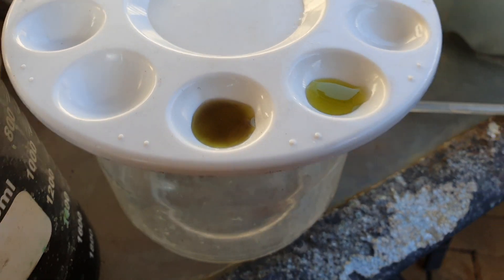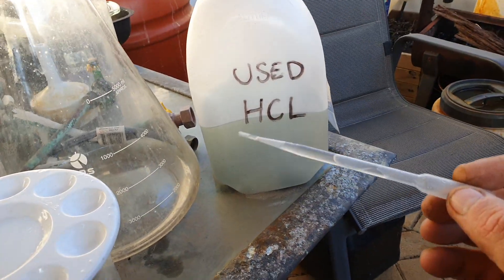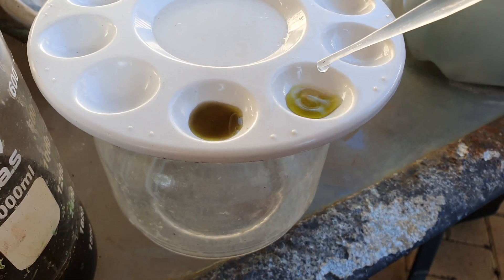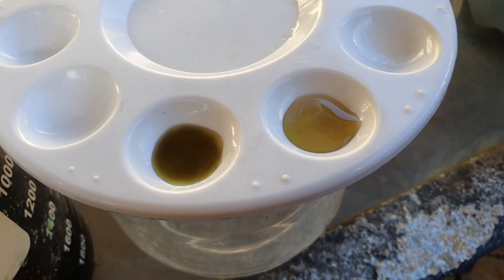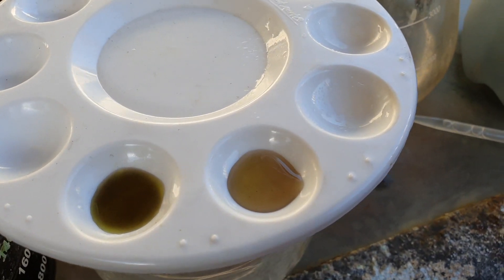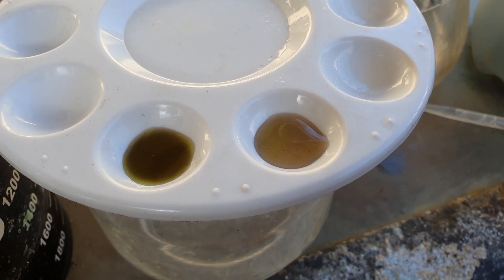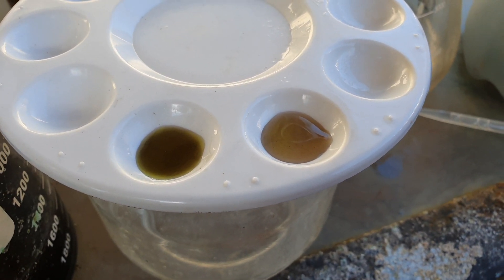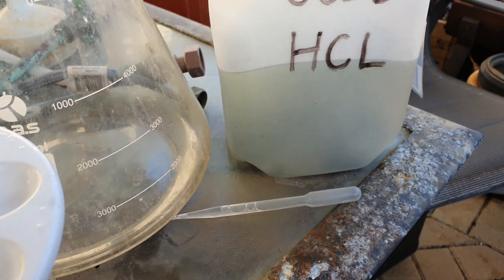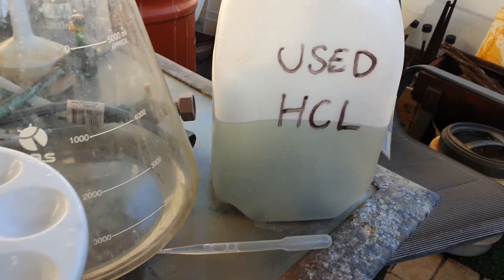So that's the stannous. Now in this pipette I have some used HCL. As you can see, it is also going dark. So yes, you don't need to make two different batches — one of stannous and then one of used HCL. You can just pull some out of there anytime you need to do a gold test and it will give you the same response.